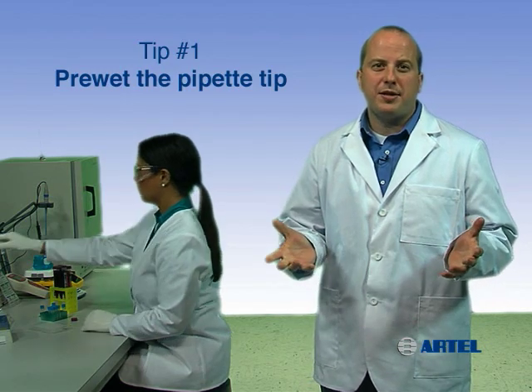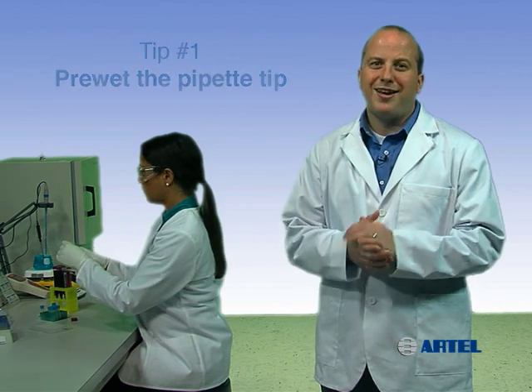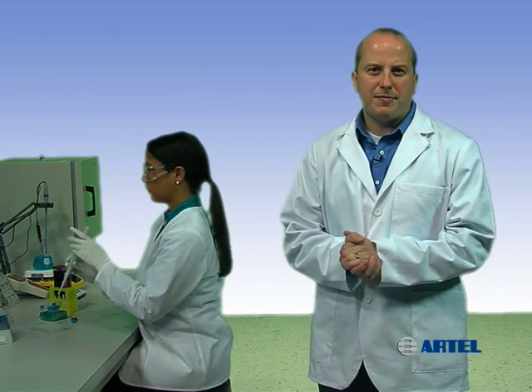Pre-wetting the pipet tip before you begin pipetting increases the humidity within the tip airspace. A humidified airspace will reduce the amount of sample loss due to evaporation. Evaporation within the tip may cause a significant loss of sample before delivery.